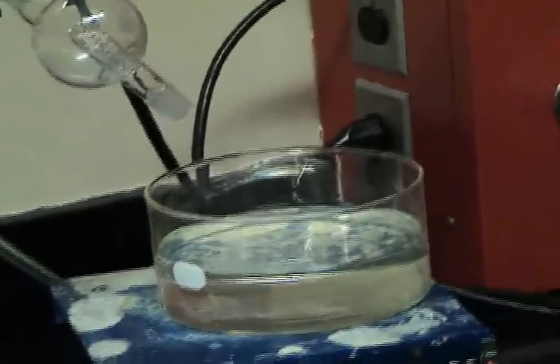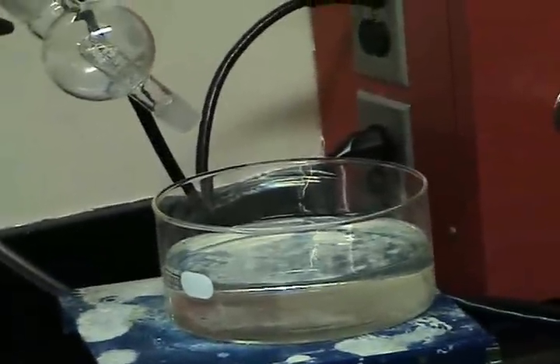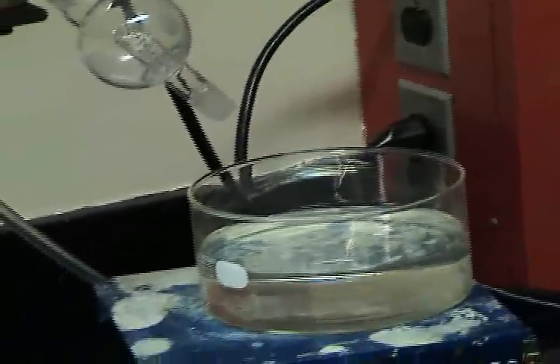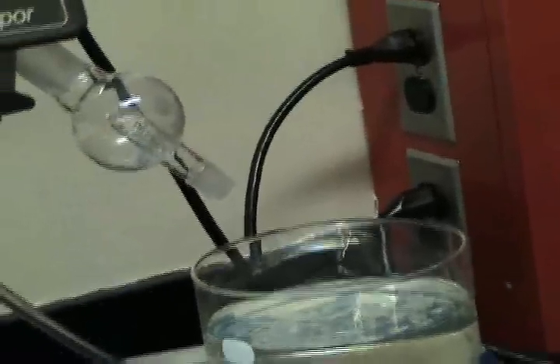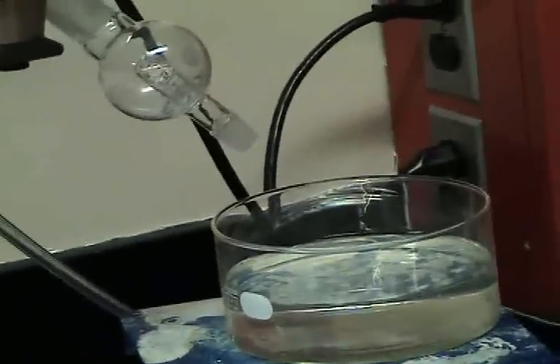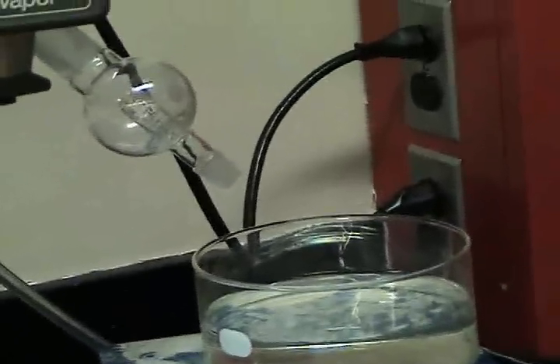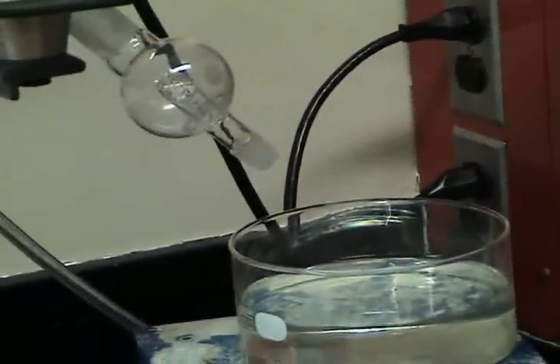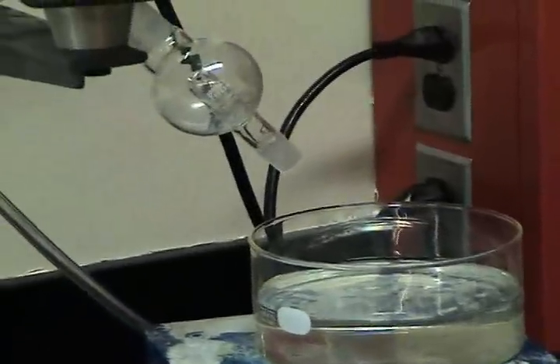This vacuum fills this cavity and down to the bump trap to where our flask will be attached. Down there we have a water bath. Why would we have a water bath? Well, when a substance boils, it is the highest energy molecules that are being jettisoned to become a gas. Thus, as these higher energy molecules are pulled off, the temperature of the solvent decreases. That is because temperature is basically the average kinetic energy, and if we are losing all of the high kinetic energy compounds, the overall temperature also drops. So in order to keep that temperature constant and speed up our evaporation, we have a water bath there to make sure the flask doesn't cool down.